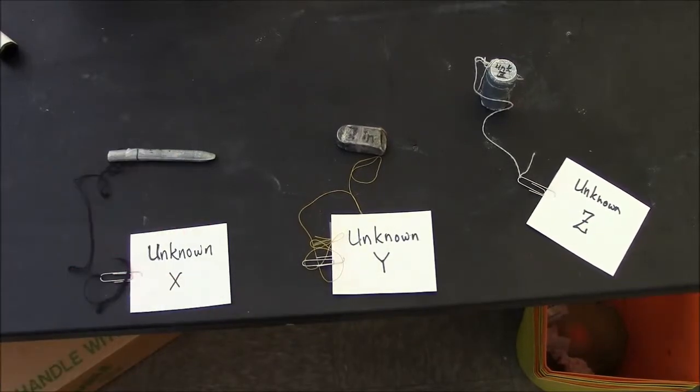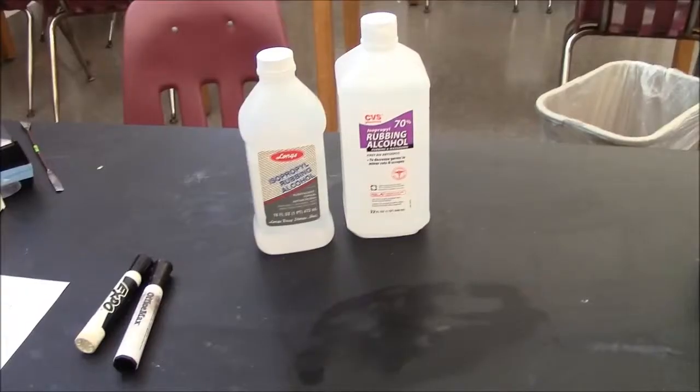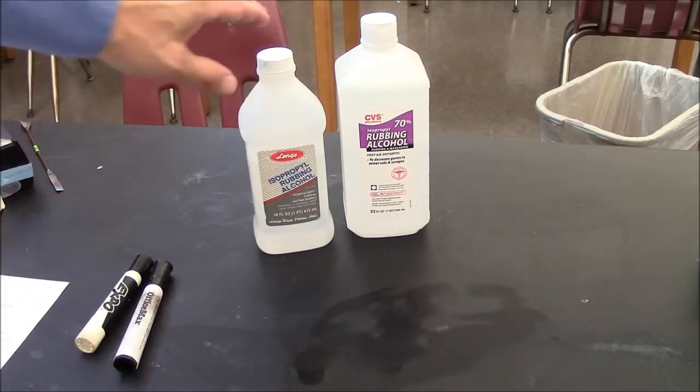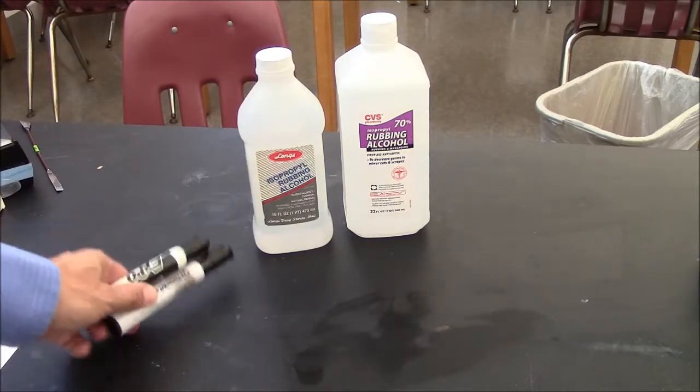Because we are sharing the unknowns, they need to come back to the buffet table. Borrow it, measure it, bring it back. The buffet table will also provide you with rubbing alcohol that you need for part 2, as well as dry erase markers here.